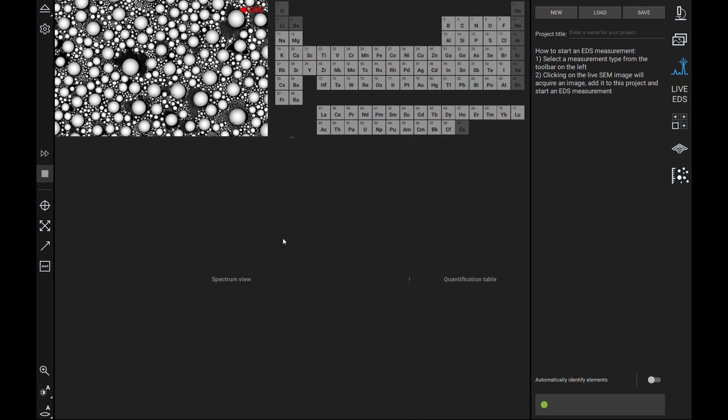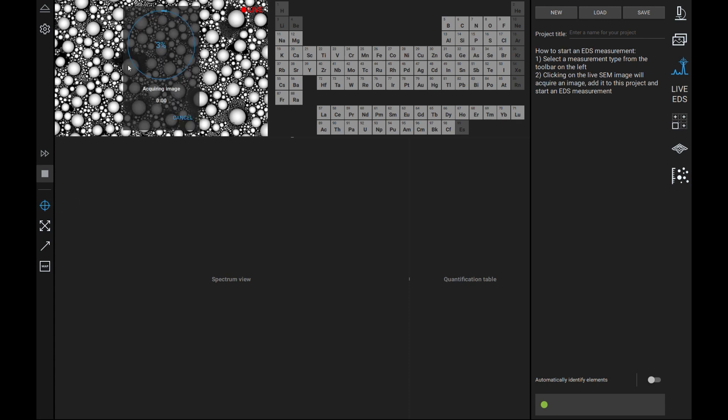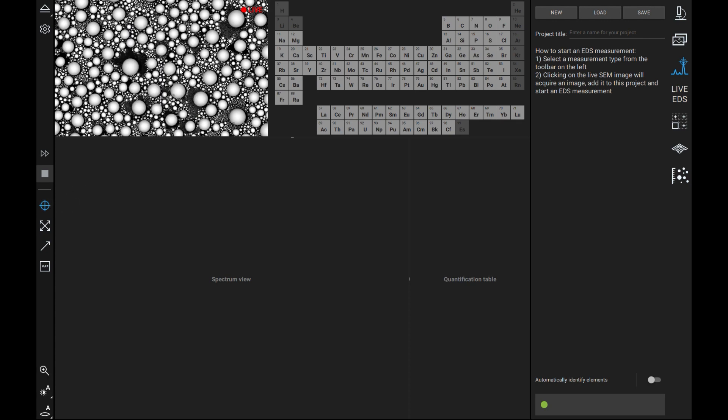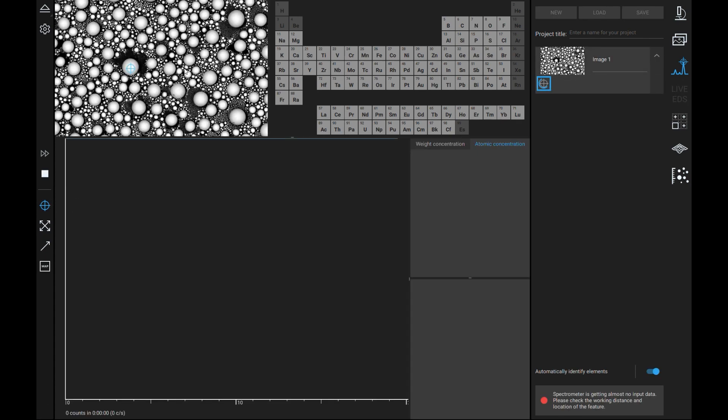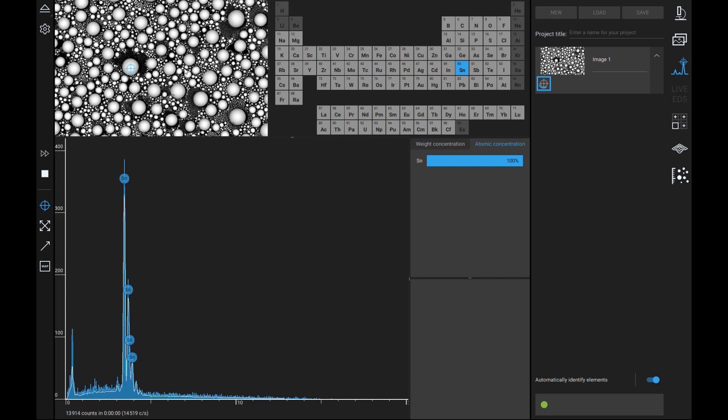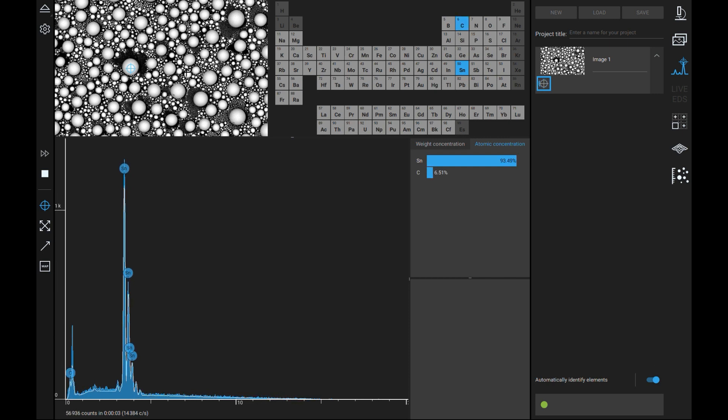EDS spot analysis analyzes the elemental composition of a specific point on an image. Simply left click the crosshair icon and left click anywhere on the image in the top left corner. A crosshair will appear and then the analysis will immediately begin. Multiple measurements can also be queued up at once to speed up the workflow by left clicking on the desired measurement locations.